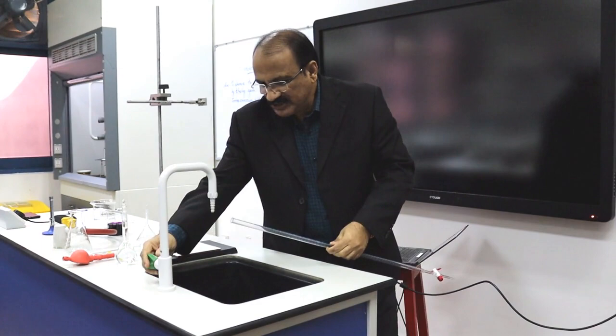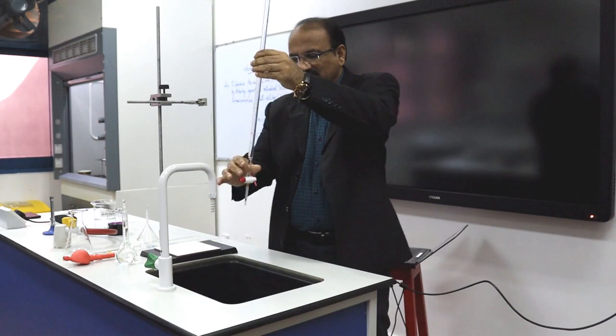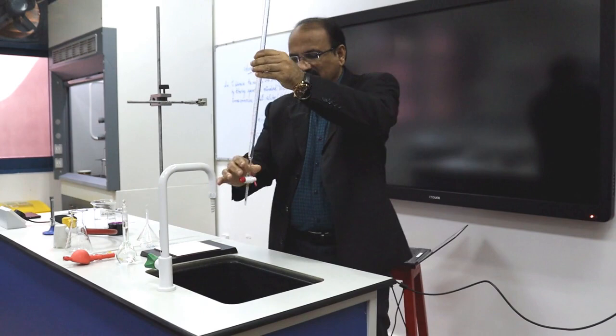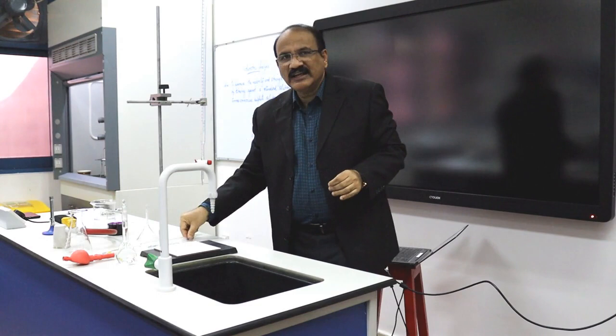We have to wash the burette. For washing the burette, keep it close to the tub. This is the way to wash the burette. Drain the water into the sink. We can clamp the burette onto the burette stand. This is called a burette stand.